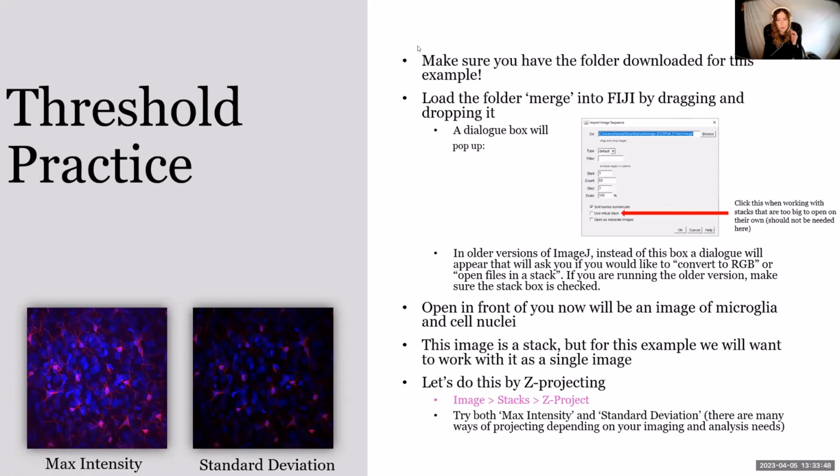Was the plugin that was used for particle analysis? Yes, it's one of the ones that comes standard with Fiji. And when you guys have opened and Z projected your images, go ahead and pop it, say done in the chat so I know to move on.